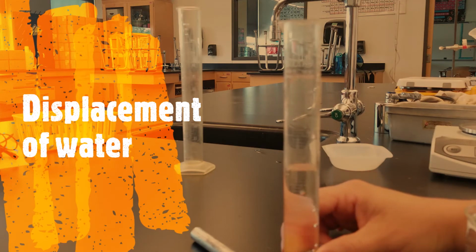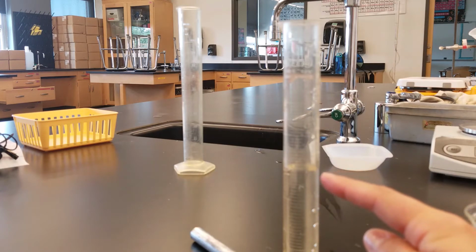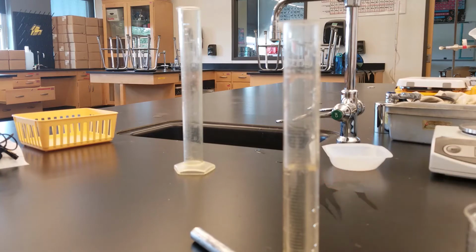Remember that when we use the graduated cylinder, we want to look for the area that scoops downward and make sure that it lines up with the measurement we're looking for. I have too much water in here right now.